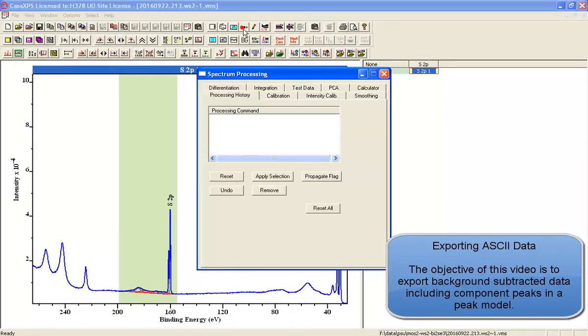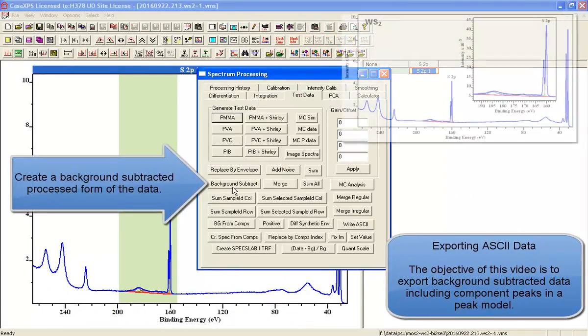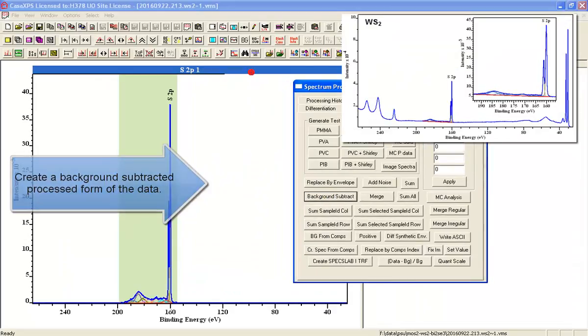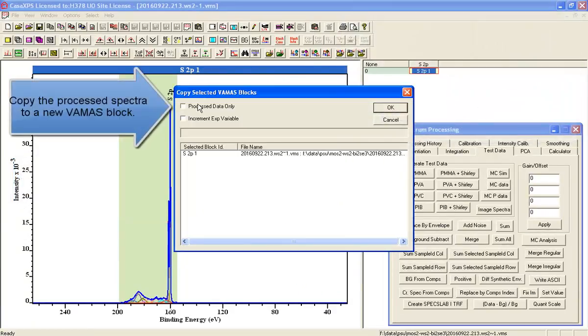I'm going to illustrate how to create background subtracted data and then transfer it through the clipboard to a spreadsheet.